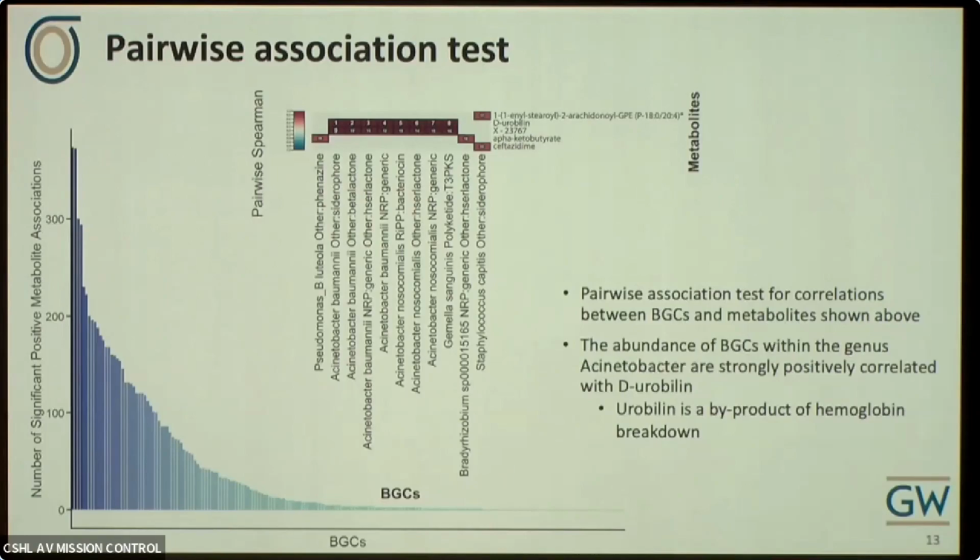So in the end, I want to quickly wrap up. seqSight is a tool, a platform for you to run things to find the BGC profile and taxonomy. And if you have a reference database, you can also use our database profile for you.